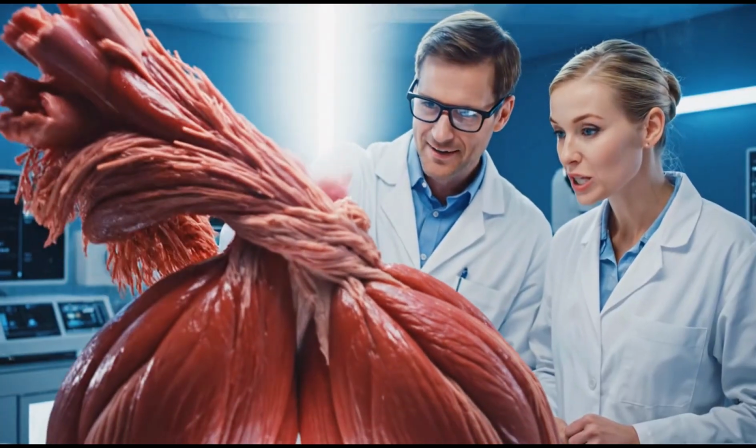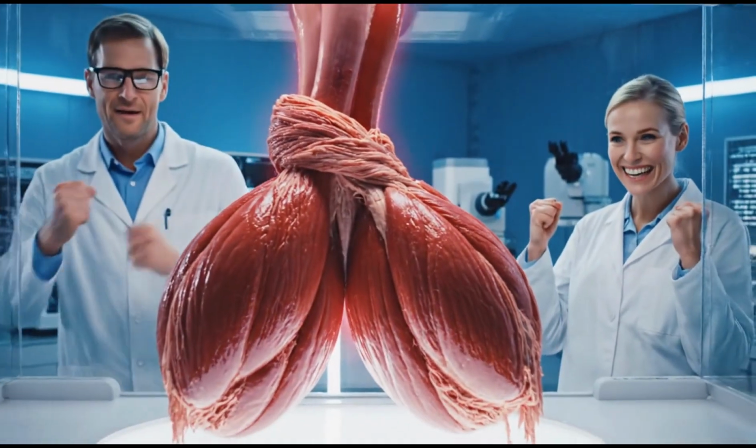Look at that pulse. It's working. Incredible. We did it!